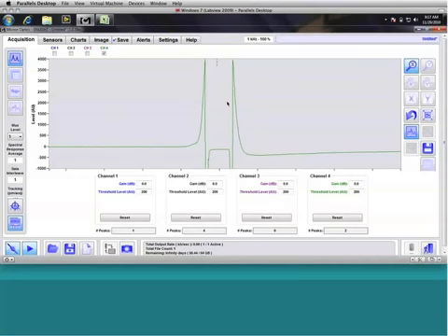And the first thing that is apparent here is this does not look like a standard optical sensor spectrum. So we immediately conclude that there must be something wrong with either our thresholds, our gain, something of the peak detection. And in particular, the issue with this sensor is that it's in deep saturation. So that means that our gains are set particularly high for the reflectivity of this sensor. For this demonstration, we've actually set the internal gains of our instrument very high so that we ensured that we would start out in this condition.